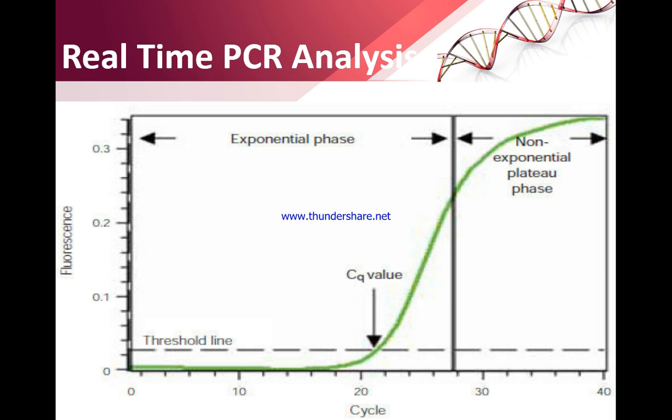Real-time PCR analysis in the exponential phase. In the non-exponential phase, we cannot see the Cq value. So this is the analysis of PCR, and that's all.